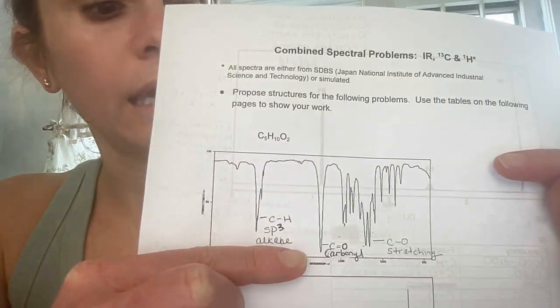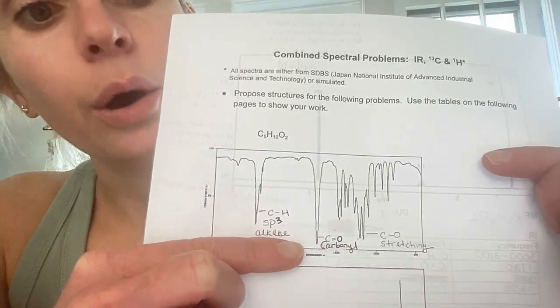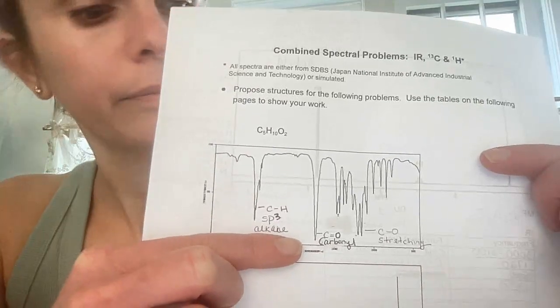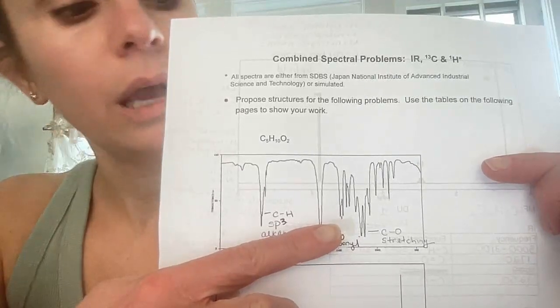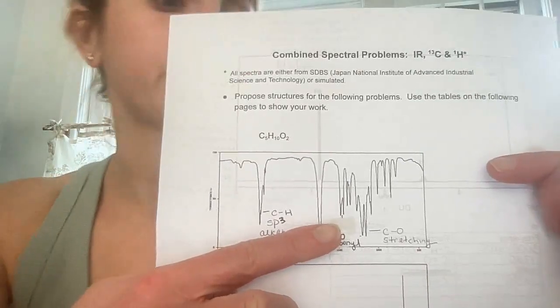We can indicate that this is where C is double bonded to O, which would indicate that a ketone is present. And lastly, we have our last stretch at around 1250 centimeters to the -1, and this would indicate that C is bonded to O.